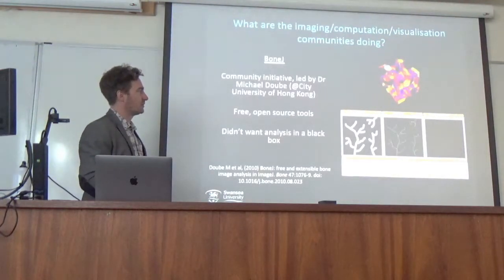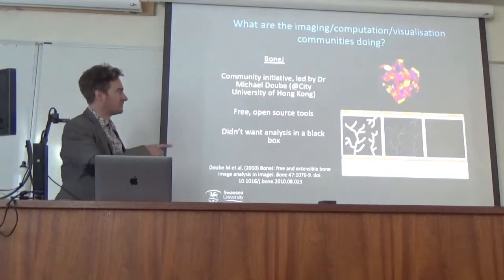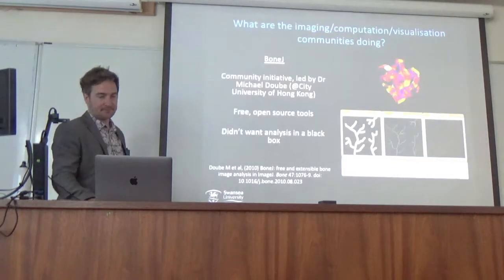And so this is a really useful piece of software and tool for doing automated analyses of bone, so trabecular thickness, porosity, pathways through skeletonization, and people can contribute to that. It's a community of people, effectively. So that's one that I like.